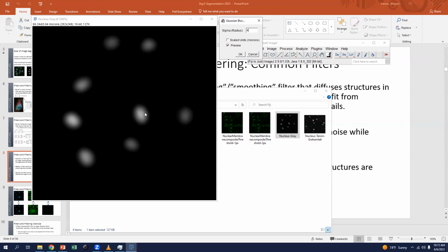And we also dissipate or distort the boundary, where before we had relatively clear boundaries, still not with homogeneous signal, but we can identify them pretty concretely. Here, they're washed out, they're spread out. The Gaussian blur filter is useful in instances where you have a very diffuse, noisy signal that's present in some locations, and you apply the filter so you can smooth that into the background. The caveat, as I mentioned, is also that it destroys internal features of your structures and the boundaries as well.